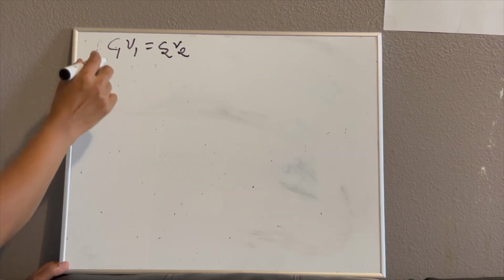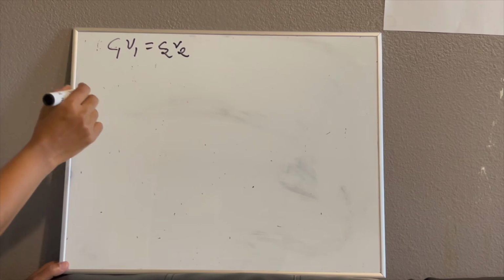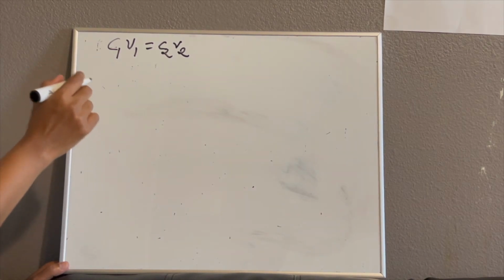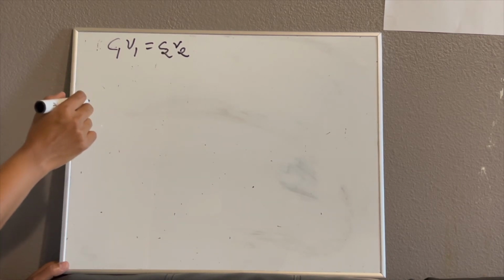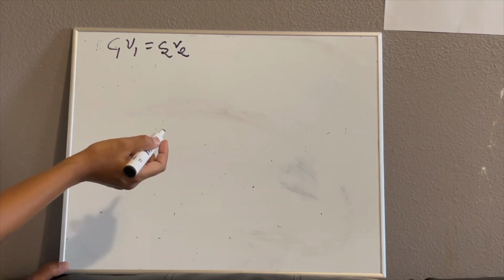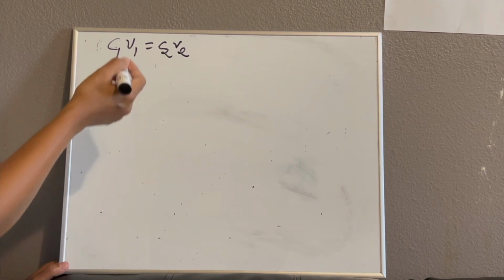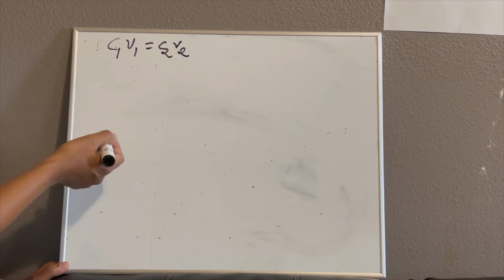And one more thing I forgot to mention during the percentages is the weighing. It's very important that we check our weighing balance has been calibrated and it is in good working condition, because if you weigh and it shows a wrong reading, the concentration will be different as the weight will not be the accurate one.